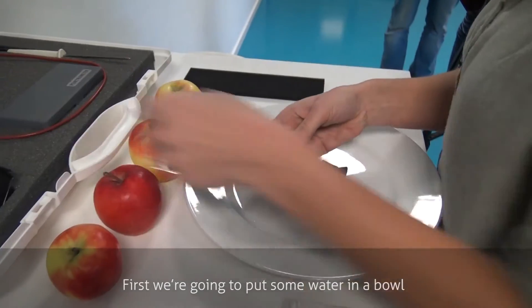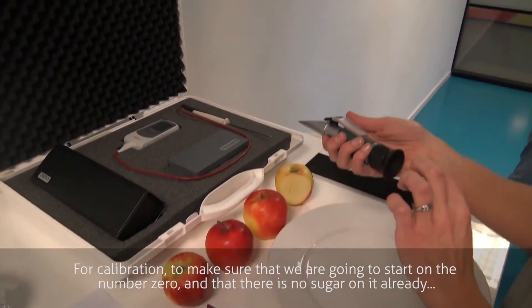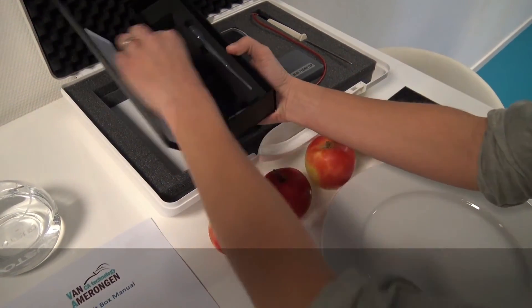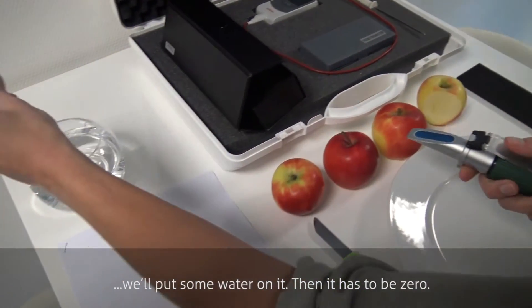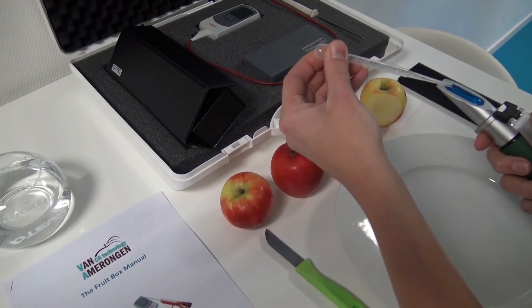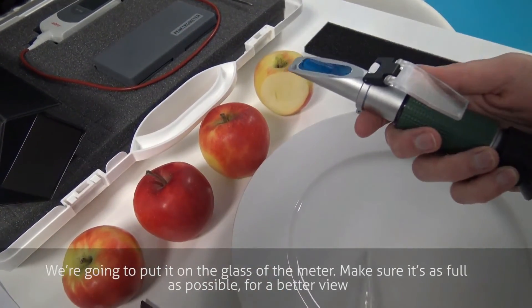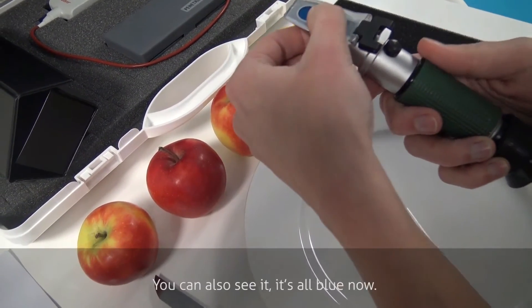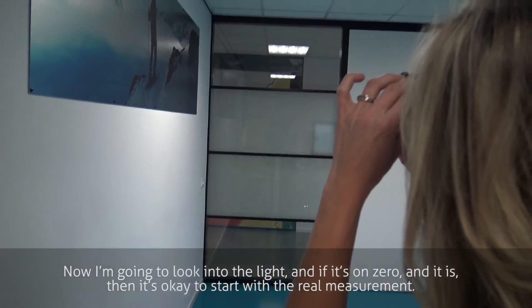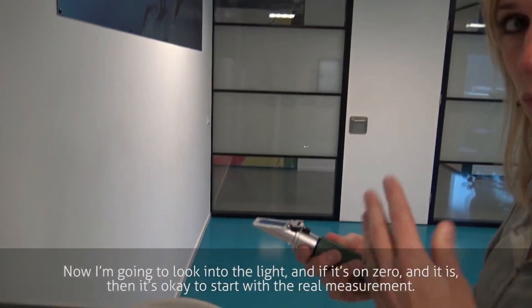First we're going to put some water in the bowl for calibration, to make sure that we start on the number zero and that there's no sugar on it already. I'll put some water on it — then it has to be zero. I'm going to put it on the glass of the meter. Make sure it's as full as possible for a better view. It's all blue now. Then look into the light. And if it's on zero — and it is — then it's okay to start with the real measurement.